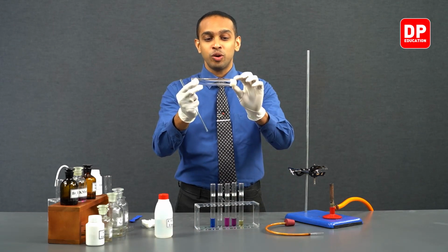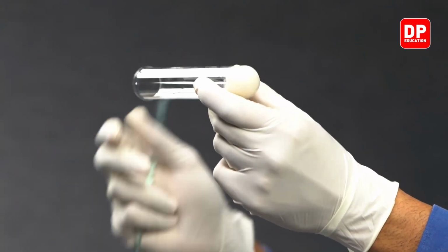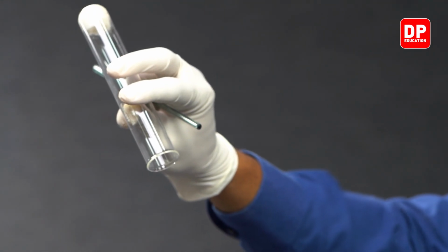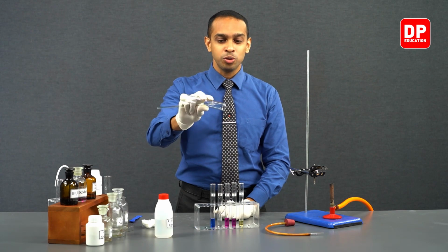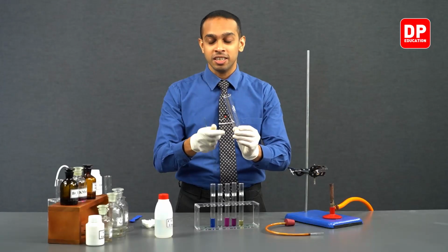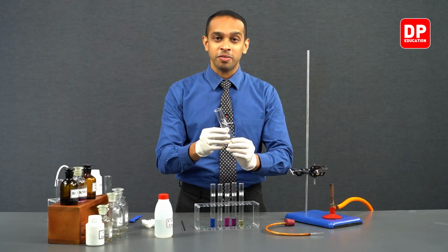So therefore, it will not allow the ethanol to flow and fall out, or if you turn it upside down, you do not see the ethanol falling back out of the opening of the boiling tube. This is because we have inserted a cotton wool and the cotton wool has soaked up all of the ethanol.